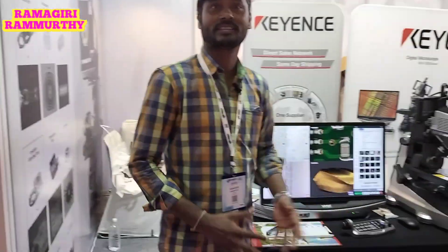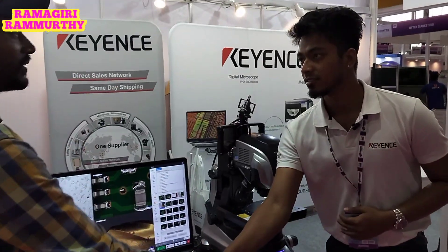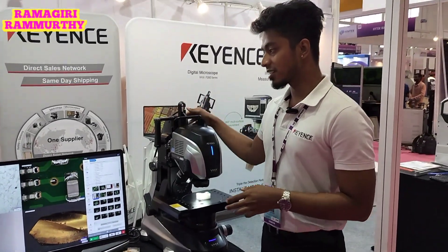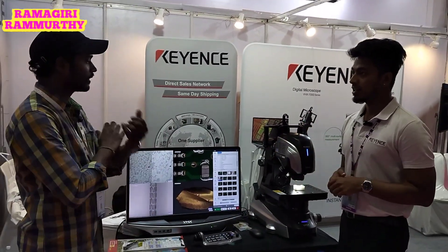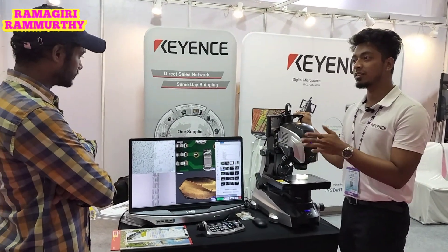So friends, we have the Keyence Digital Microscope. Keyence is a Japanese-based company heavily involved in the industrial automation sector. This is our latest digital microscope, the VHX 7000 series.